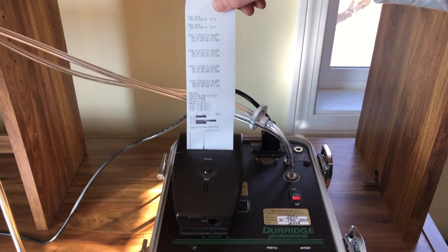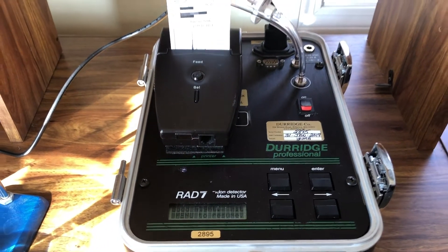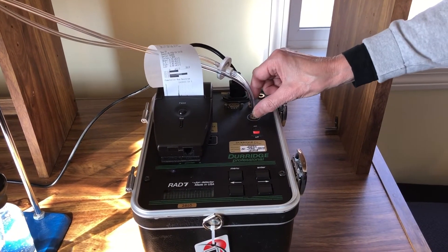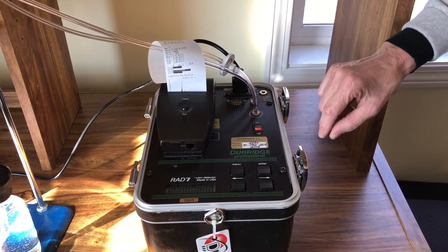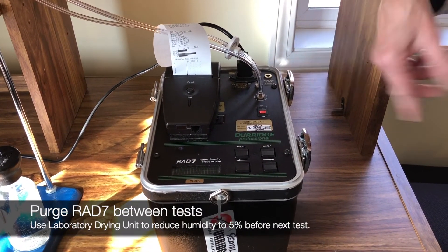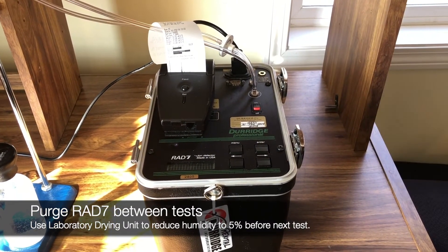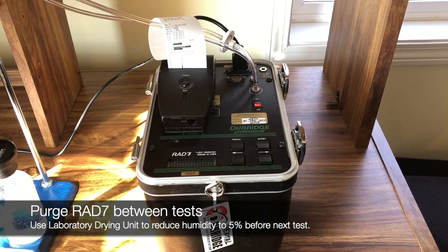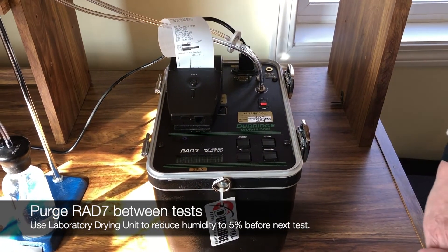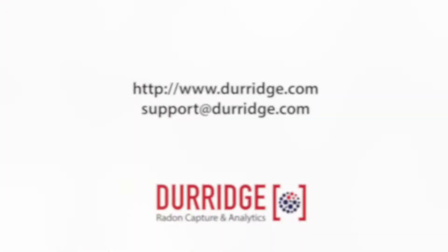As you can see, it says it's done. So at this point you can download your data. Or if you have other samples to run, unhook the tubing from the rad7, hook it up to a lab dryer, and purge any of the old radon out of the chamber. Make sure that the RH is down to five percent before you re-hook these tubes back up and put a new fresh water sample in and repeat this process. And that's it.